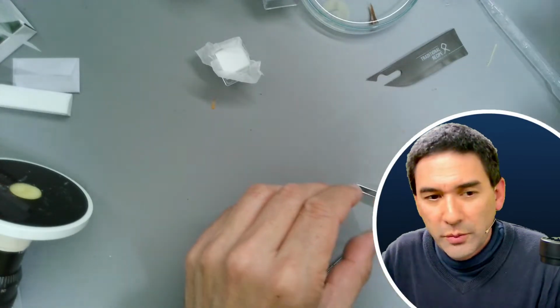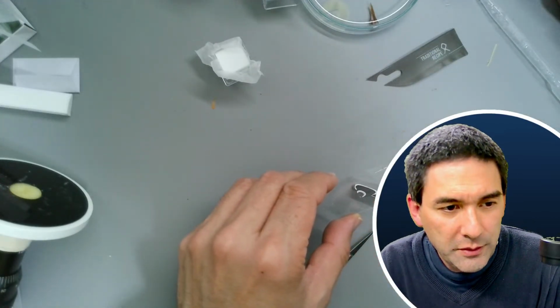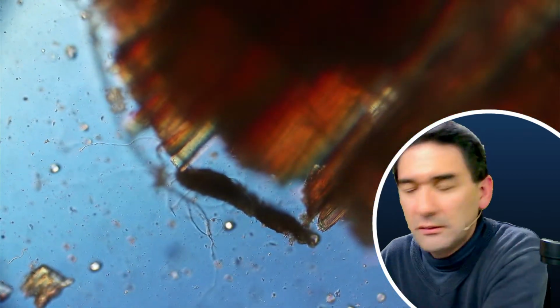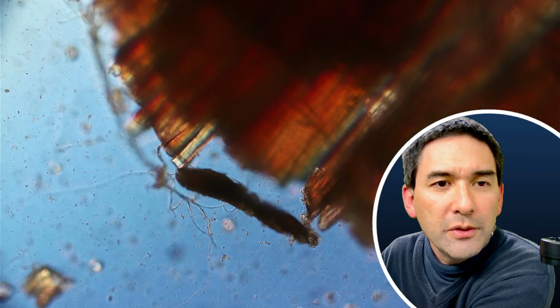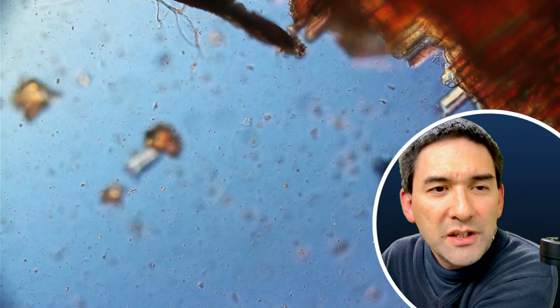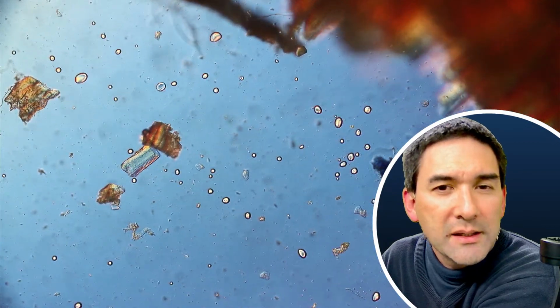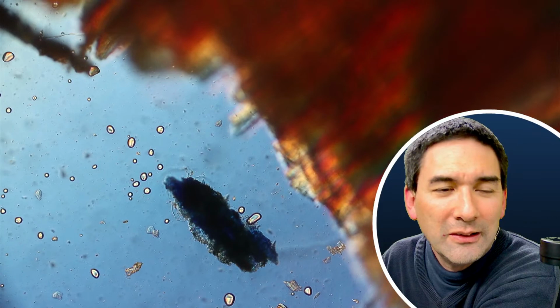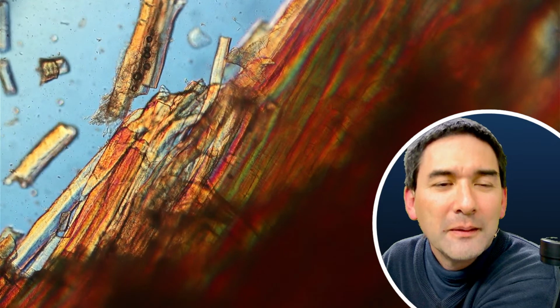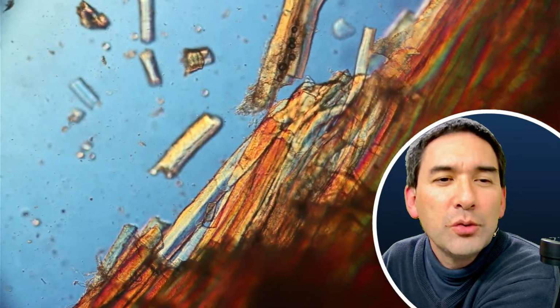So let's switch over again to the microscope view, which again probably no, actually now it works. Now there is a rapid response, interestingly. And here it is. I can actually see the individual fibers. That's good. I'm hoping to be able to see the so-called light and dark bands. Okay, here there are some individual fibers.